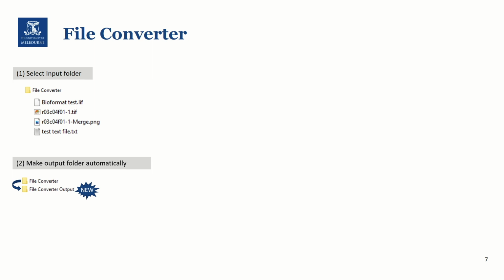After we cover this, we will look into the contents of the folder, and in the previous example, we only had TIFF files nicely arranged in a folder. But in a real example, our folder may contain all different types of files. Or we may want to select a specific group of files. So as a third step, we will practice how to filter out the files we would like to use based on the file name.